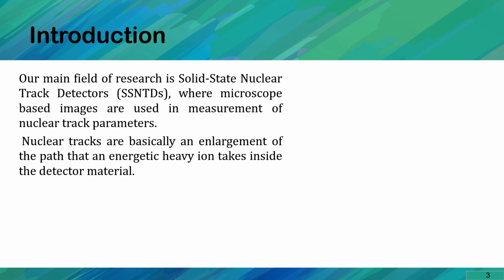Our main area of research is in the field of solid-state nuclear track detectors, abbreviated as SSNTDs, which are basically detectors of nuclear radiation. The nuclear track is nothing but an enlargement of the path that an energetic heavy ion takes inside the detector material. The images of the tracks are captured under a transmission microscope, which are then used in measurement of nuclear track parameters like the length, diameter, density, etc.